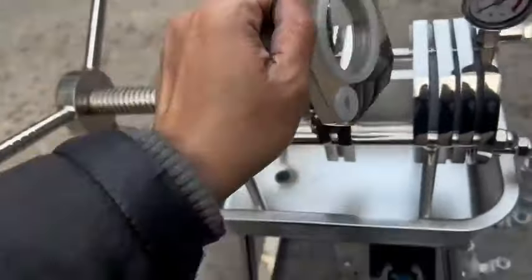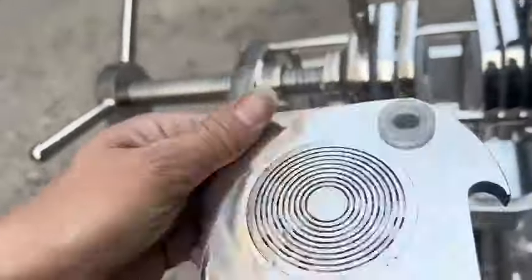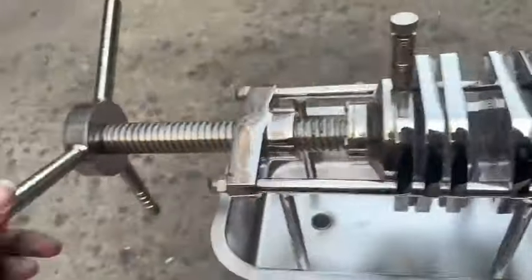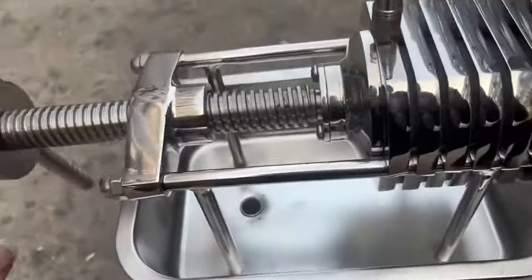Filtration accuracy: 50–0.22 μm. Filtration pressure: 0.05–0.6 MPA, suitable for all kinds of solution collection and sterilization filtration.